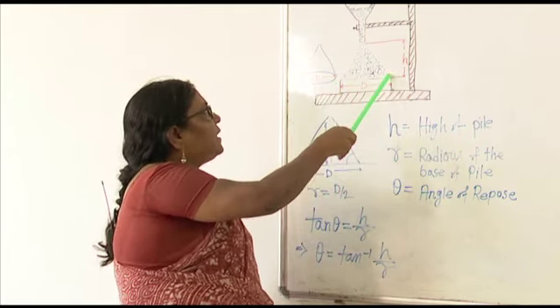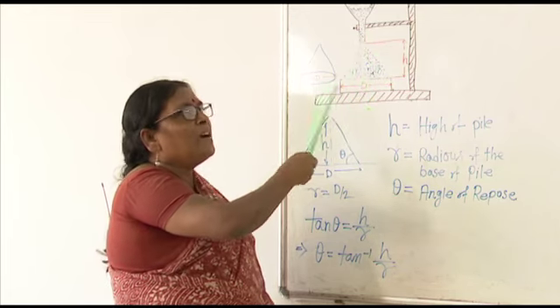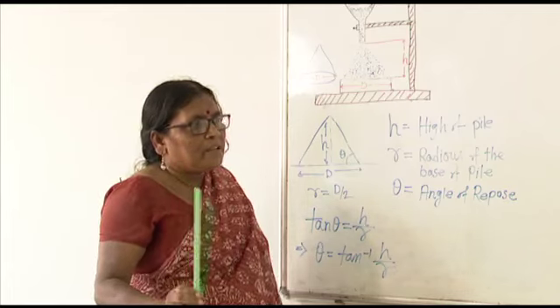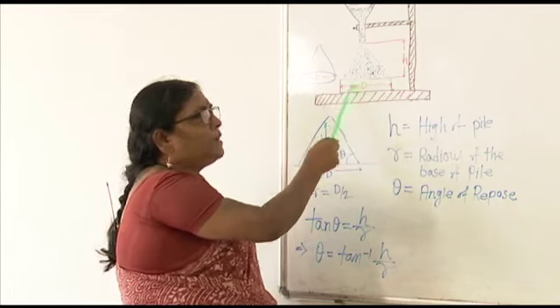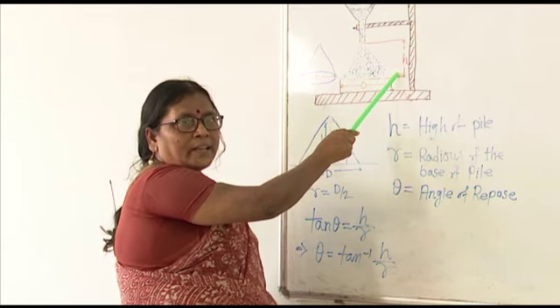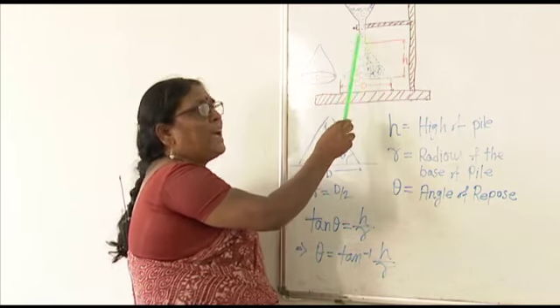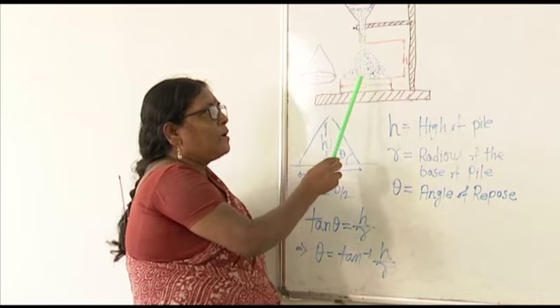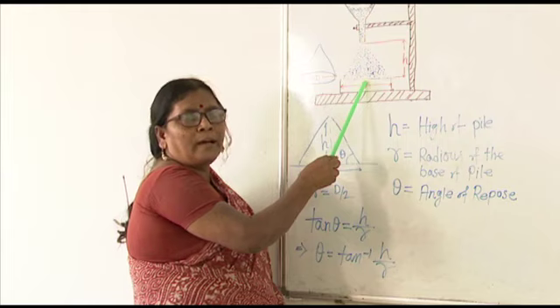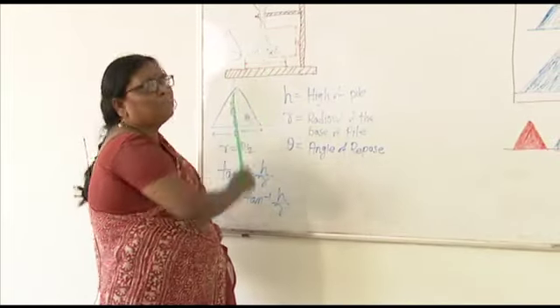You can see that the more the quantity, the more the time, and the more the unpredictability. So you can fix a circle area and allow the material to come up to that area. That is another way. The guideline is to keep your funnel as close as possible to the ground. Now you may ask me, why should we measure this angle?